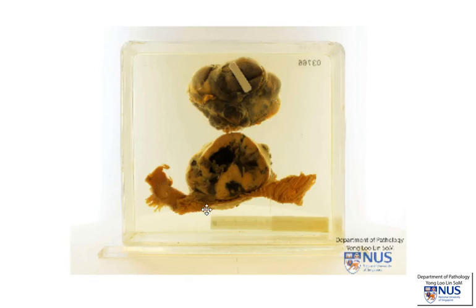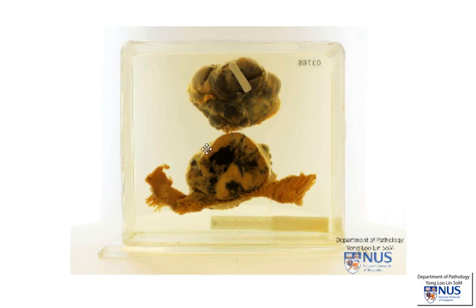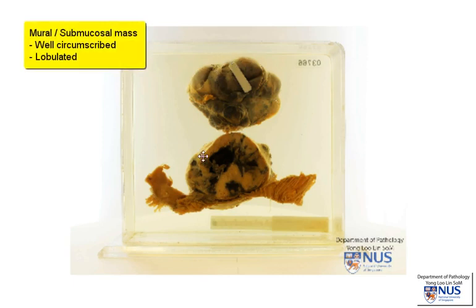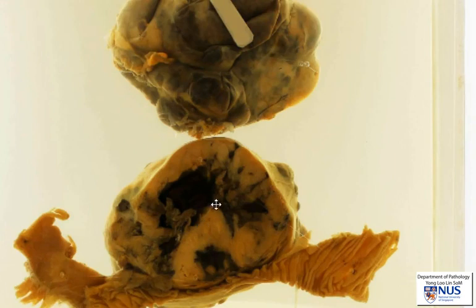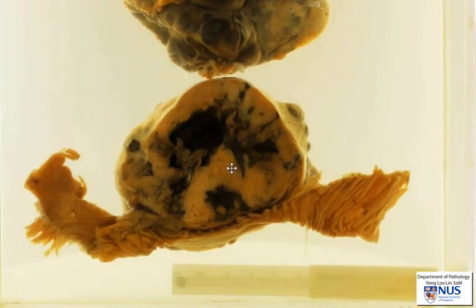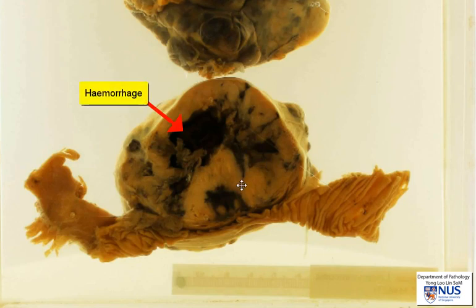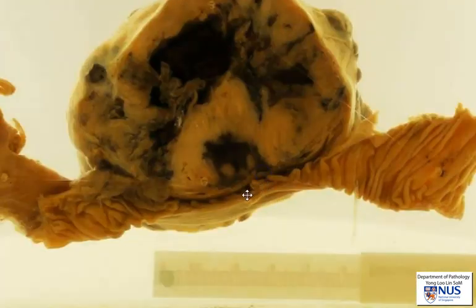This is a specimen which shows a segment of small bowel, and here we're looking at the mucosal surface. There is a large, relatively circumscribed, somewhat lobulated mural mass. This mass is rounded or spherical, and it has a tan cut surface with these patchy, dark, blackish areas of hemorrhage. Looking at the mucosa, we can see that it's still intact, overlying the mass.